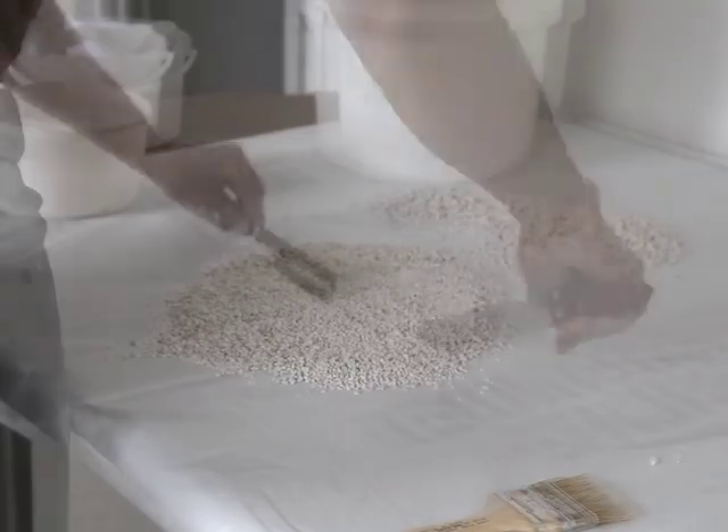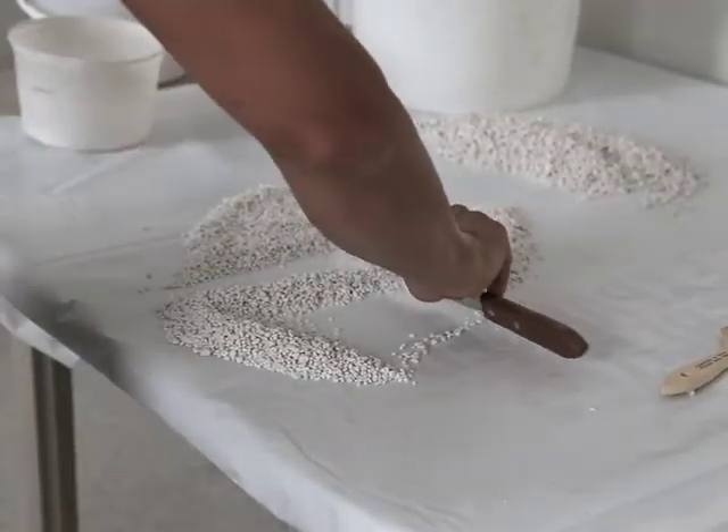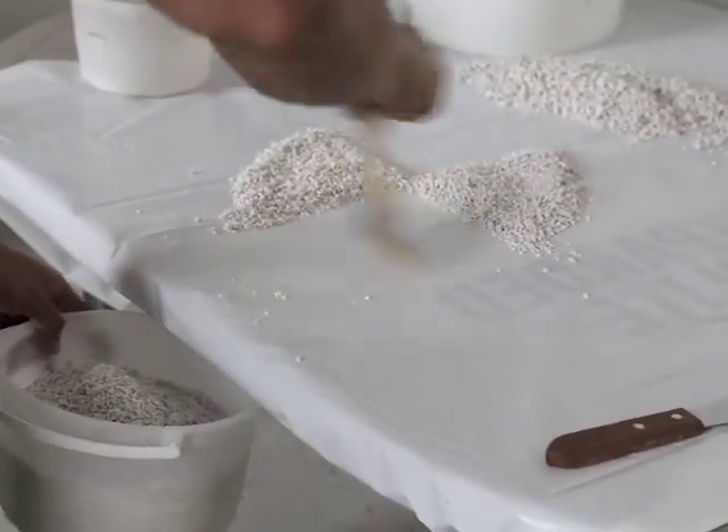Continue this process of piling, flattening, and rejecting two quarters until the sample is reduced to the approximate required testing size.